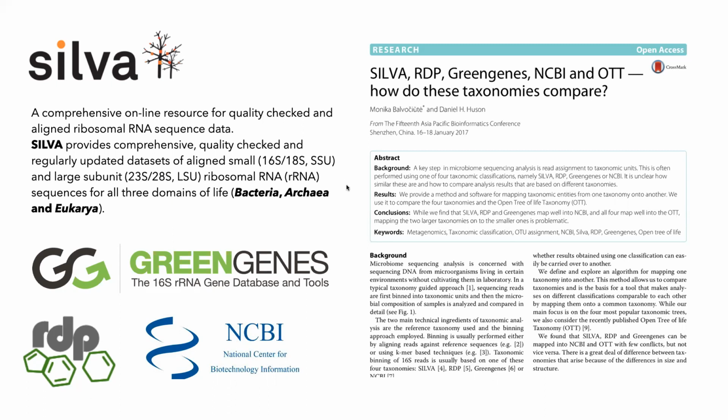Okay, so we have the process of sequencing. The sequencing information yields some kind of a sequence that is known and is organized into a group. We call those groups operational taxonomic units.